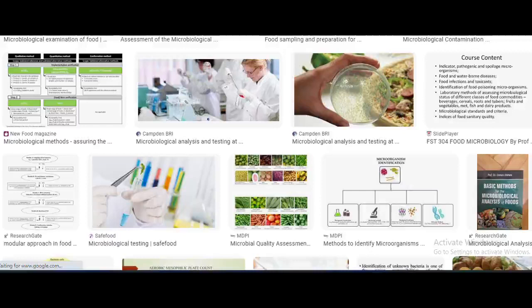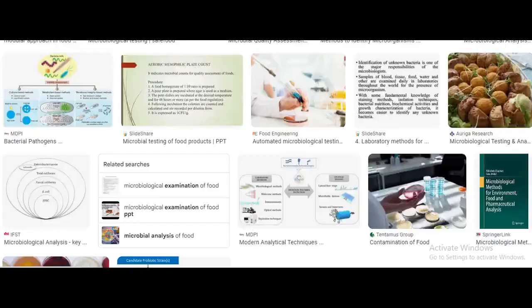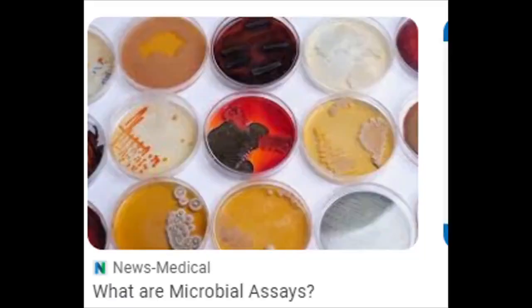The total mesophilic plate count is widely used as a broad indication of microbiological quality. That means the total amount of bacteria that we find at normal temperature. Mesophilic organisms are organisms that grow from a temperature of about 27 to 40-something degrees Celsius. Then we have the thermophiles.